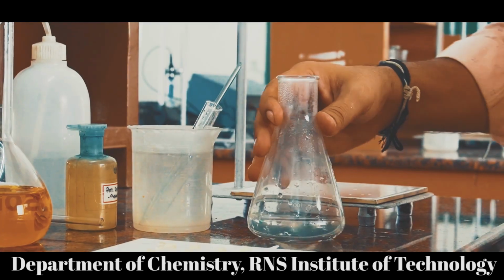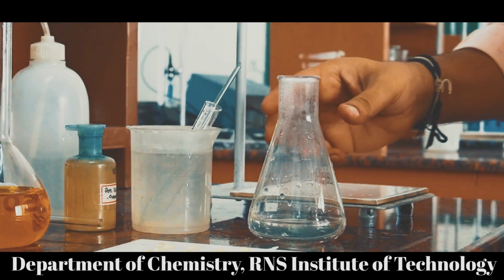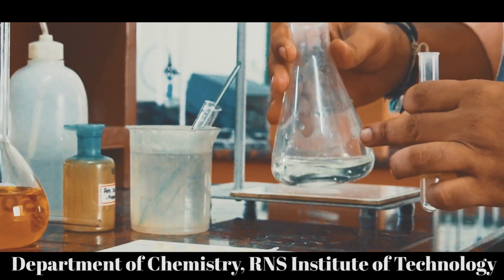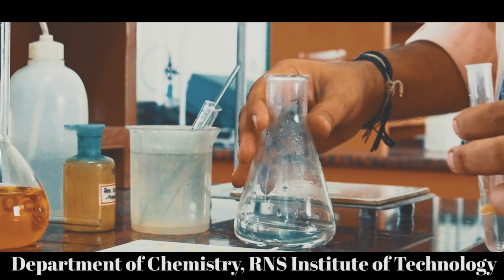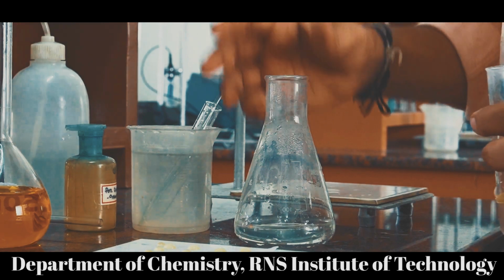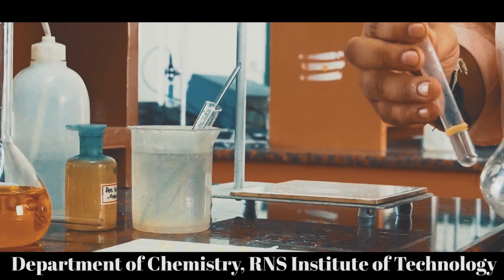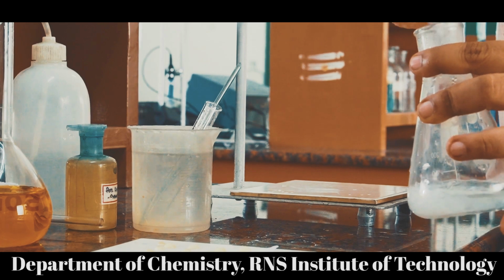Now for the second trial, I will refill the burette to 0, right? That is the standard K2Cr2O7 solution, and then I have pipetted out 25 ml of TMT bar solution. To that I have added 1/3 test tube of dilute HCl, then heated the solution near to boiling, and then in the hot condition I have added stannous chloride, until the color of the solution became colorless. After that I have added 2 more drops to ensure complete reduction, and then I have added 2 test tubes of distilled water, and then we need to add mercuric chloride, that is a quarter test tube, so that we are going to get a silky white precipitate like this. Okay.